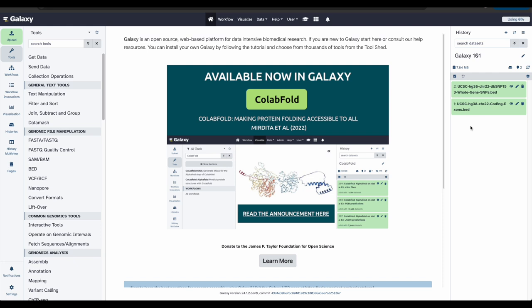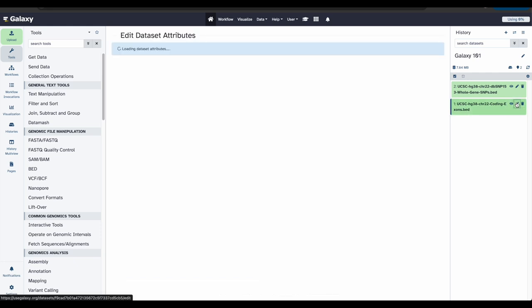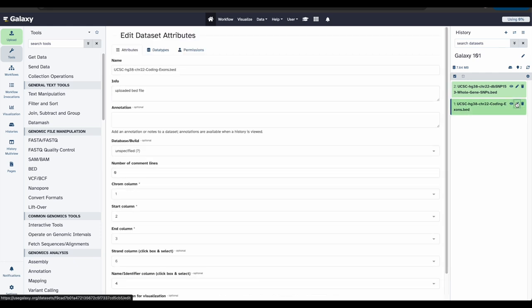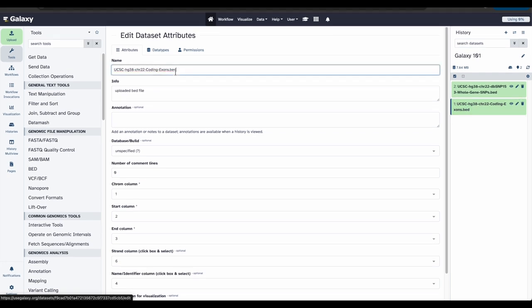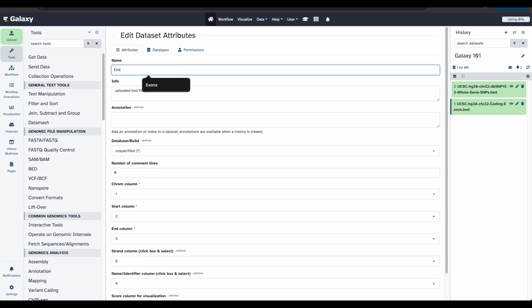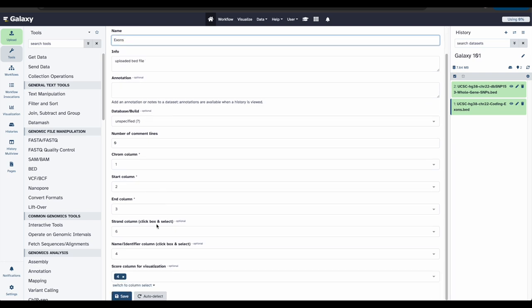To do that, go to the first data file and click the pencil icon. In the center panel, we can update the name field. For this data file, let's change the name to exons. Scroll down and click save.